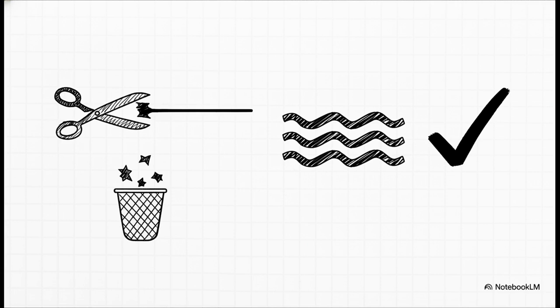Why? Because unlike DNA sequencing, where a duplicate almost certainly means a PCR error, in RNA-seq, duplicates are totally natural for highly expressed genes. If a specific gene is just churning out thousands of copies of mRNA, we absolutely expect to see identical reads. Deleting them would literally destroy our biological data.